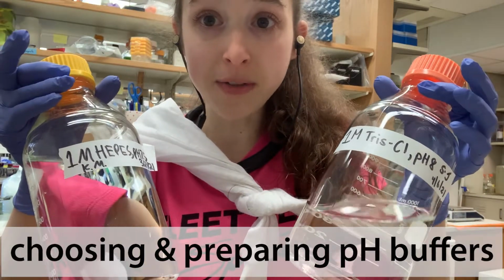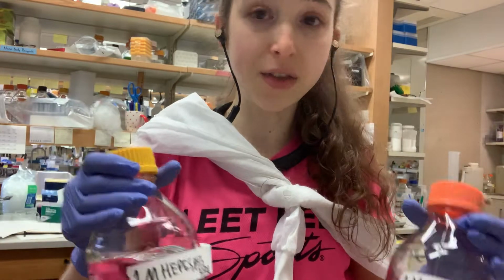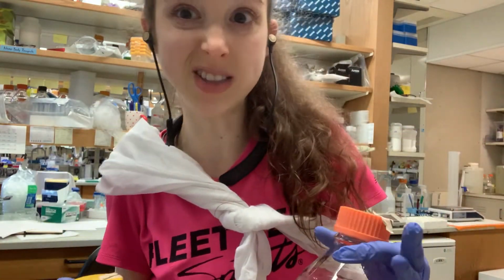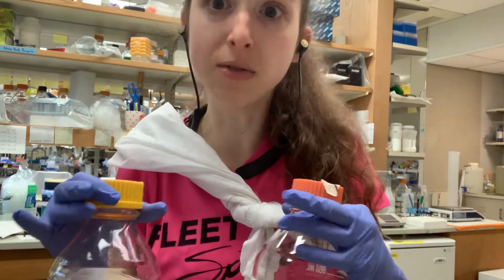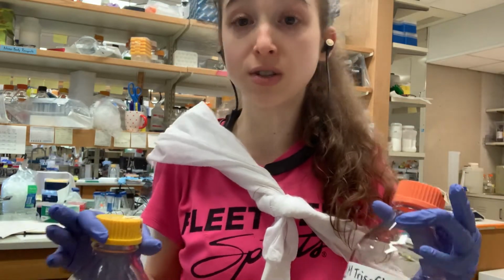Blunder when brewing your buffers. So buffers are pH stabilizers, and there are different buffers that we can use, and the ones that we use depend on what pH we're trying to stabilize, as well as other things like whether a component of the buffer might react with something in our experiment. And so there are different reasons to choose different buffers.